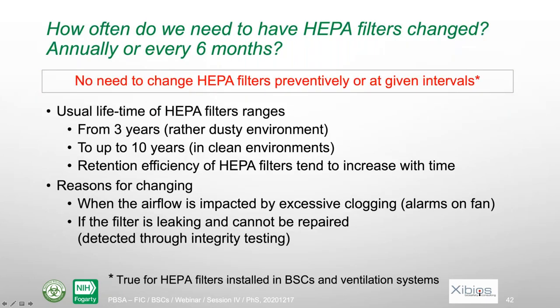The next question is about HEPA filters. How often do we need to have HEPA filters changed, annually or every 6 months? That question was asked before we discussed that, but it's a very important point. Remember that we don't need to change HEPA filters preventively or at given intervals. HEPA filters can last for 3 to 10 years in a very clean environment. And also their efficacy will increase over time.